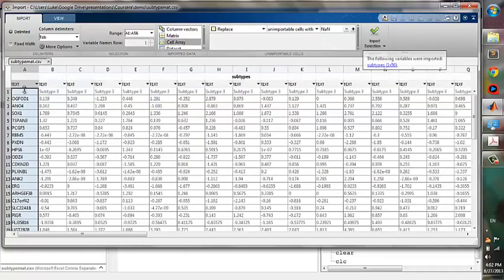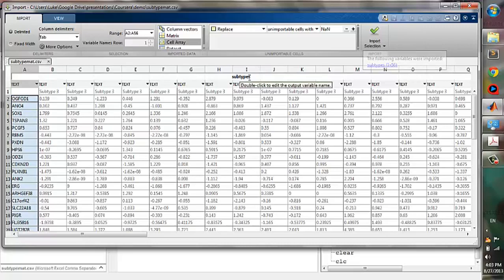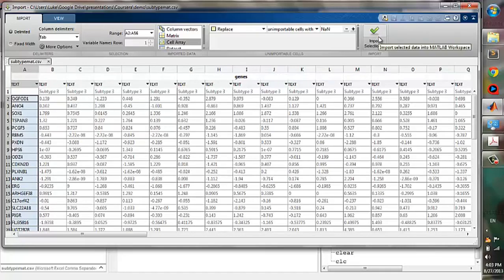The next step is to import the row labels, which are the gene symbols. We also import them as a cell array and name it as genes. The data type is already text, so we won't change that, and click import.